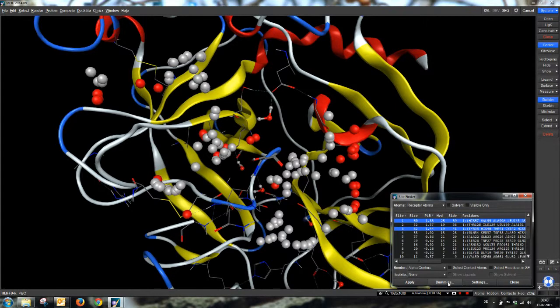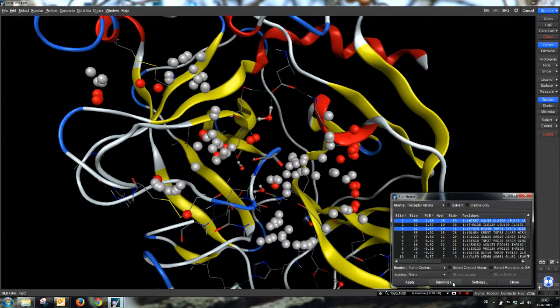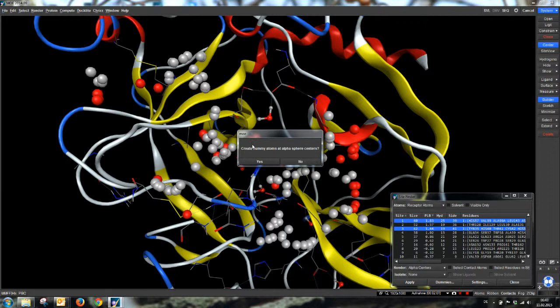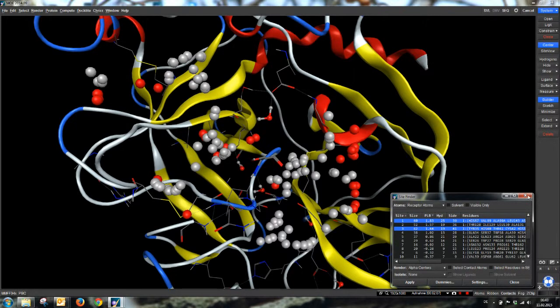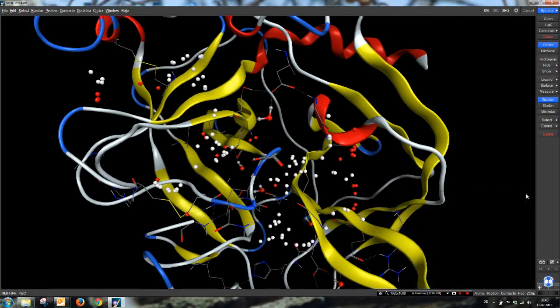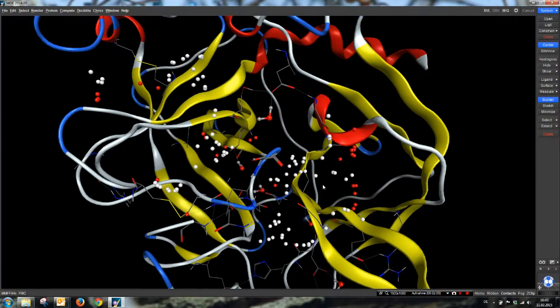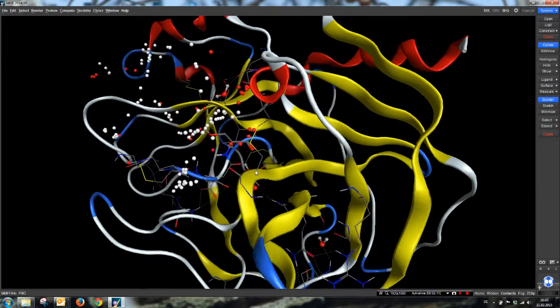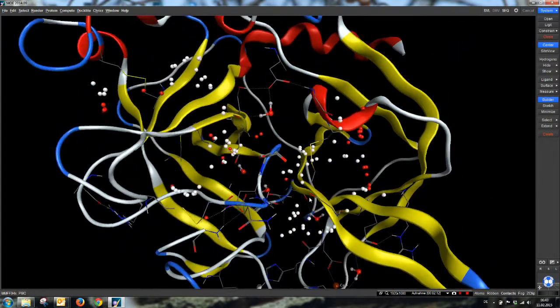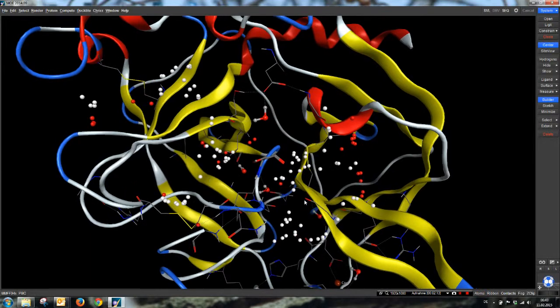And we create dummy atoms by clicking on dummies. Now Mo asks if we want to create dummy atoms at the alpha-sphere centers here. We want to do this. Now we can close the SiteFinder application and we have our dummy atoms in place.